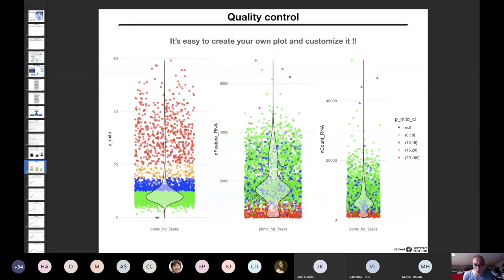And when you plot these cells on the other graph with the UMI or the number of genes detected, you can see that these cells tend to go to the lower values of these variables. So these cells can be problematic.